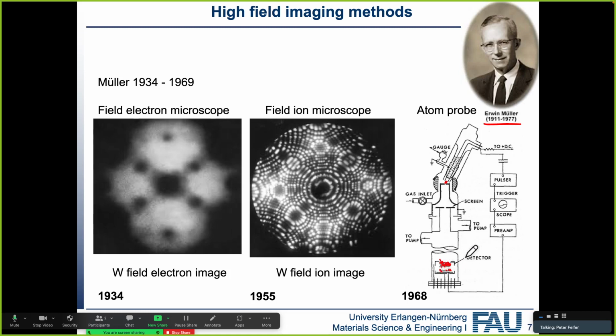And we'll look into detector setups later. And as I said, you have some kind of aperture here. There's a field ion microscopy screen to aim, so you can move your specimen around, you can tilt it, so that you can find a certain spot on your specimen, and you have a probe hole in your screen, just like you would have a hole somewhere in the middle here, so that you could aim.